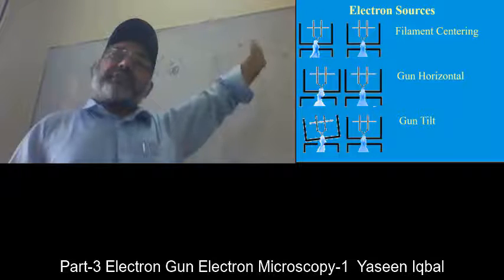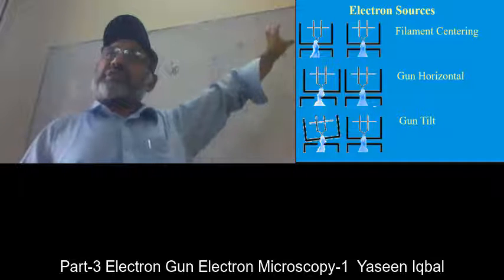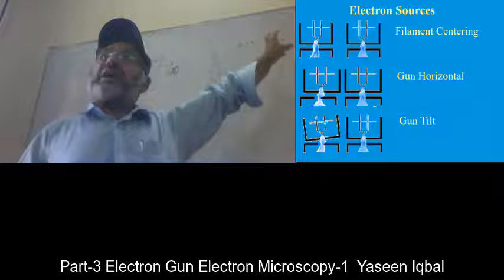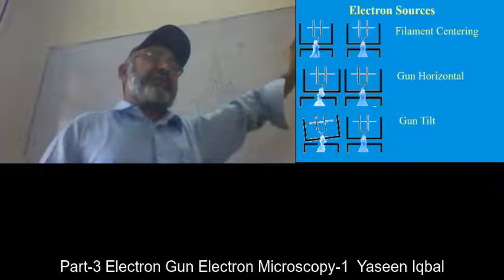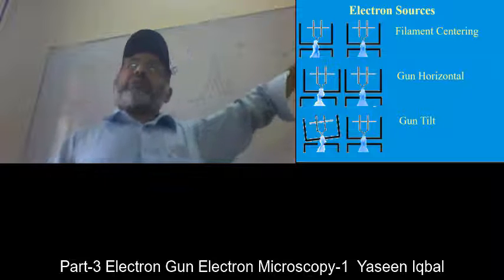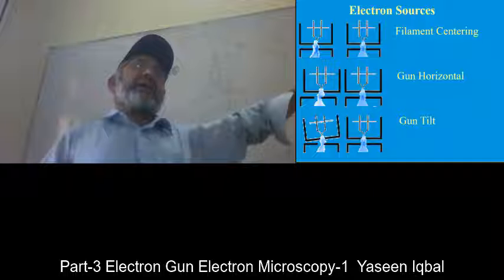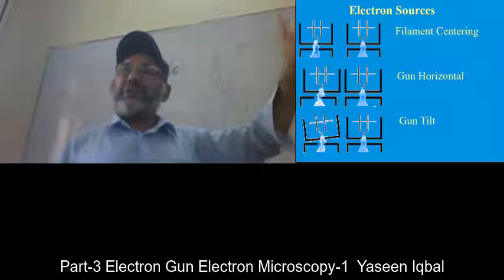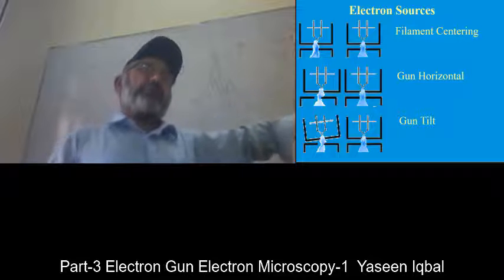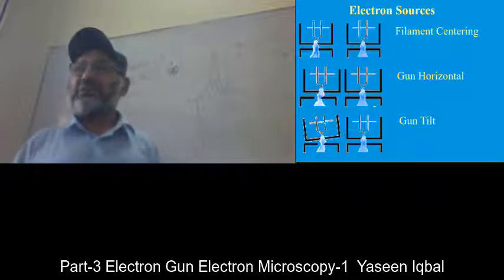The first thing electron microscopists do is to focus the gun. And that is why learning electron microscopy needs years, right? In the modern world, people are going for shortcuts, but in the days I was doing electron microscopy, it took me 1 year to become an approved user of the lowest level conventional electron microscope.